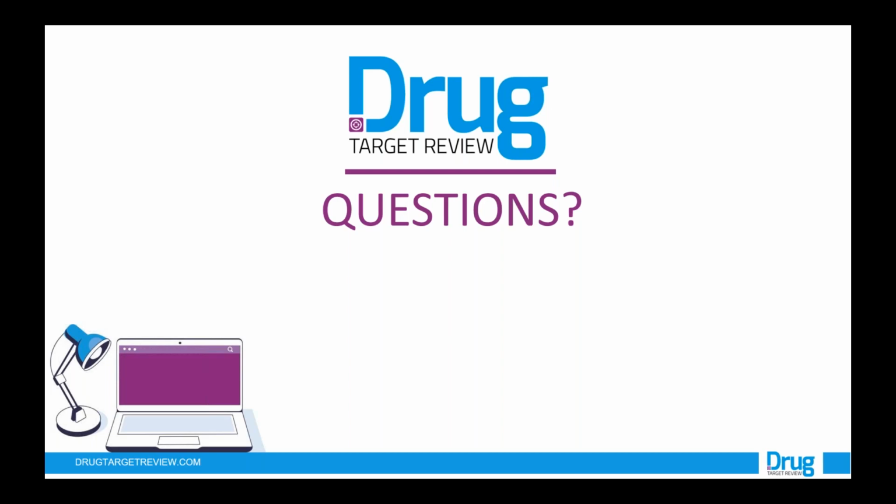Thanks, Paul. So another question for you now. What would you say regarding a compound changing a protein's Hill slope in its melt profile, but still giving the same melting temperature value? Yeah, that's a little tougher. So I suppose that would be reflective of target engagement. I have to be honest, we really haven't seen that.